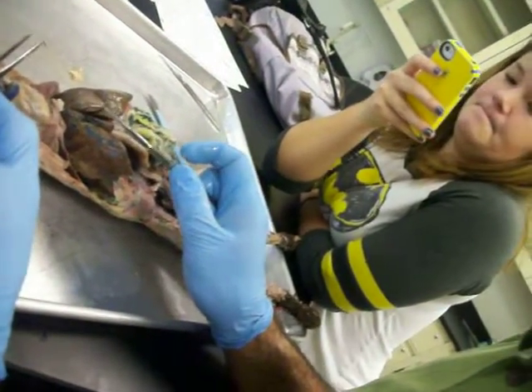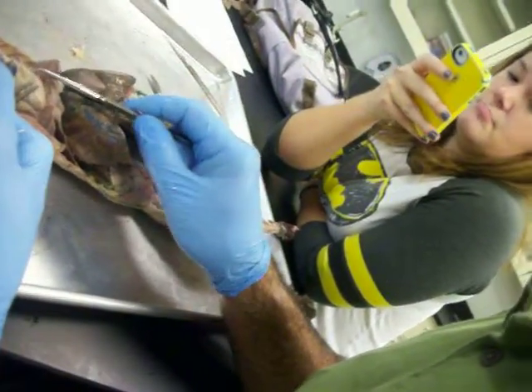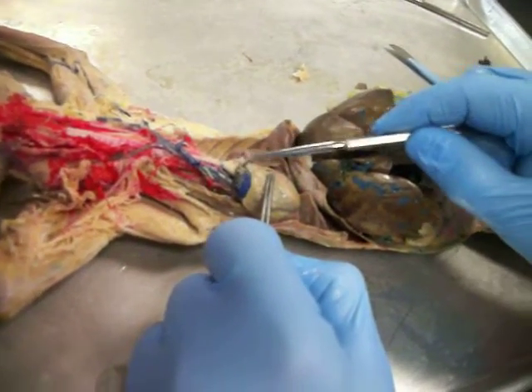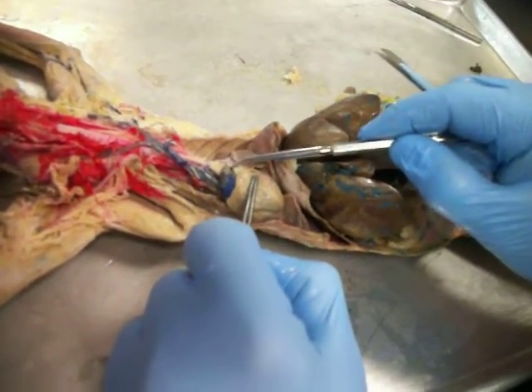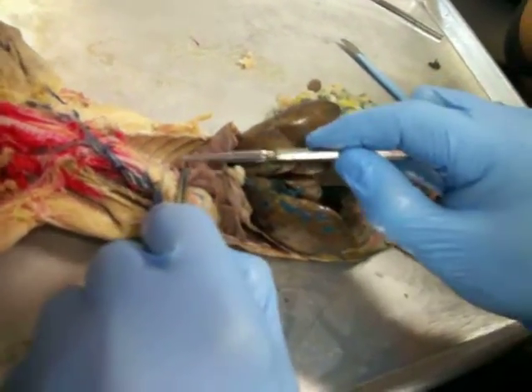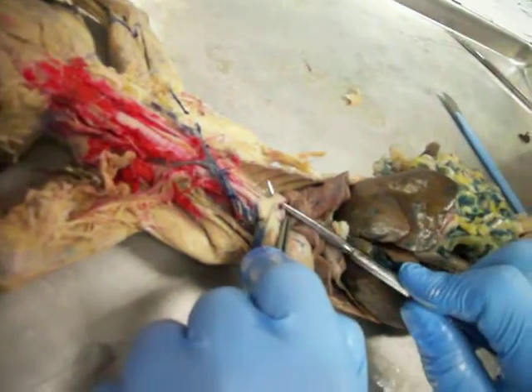Alright, I'm starting. So this is the heart. This is the aortic arch right here. The first part is the ascending aorta. This is our aortic arch. And then this is our descending thoracic aorta right here.